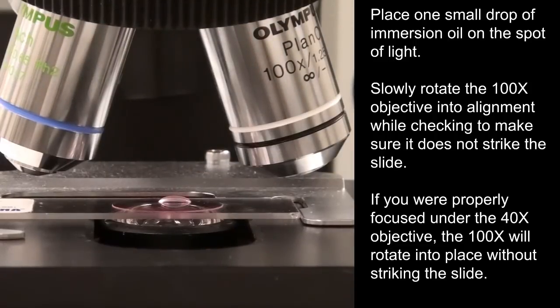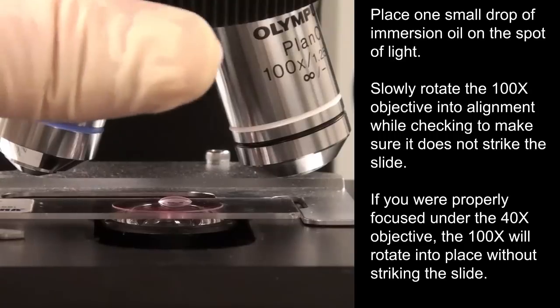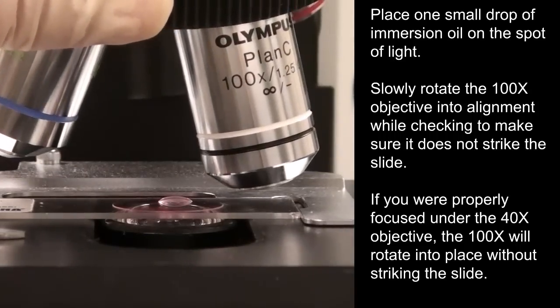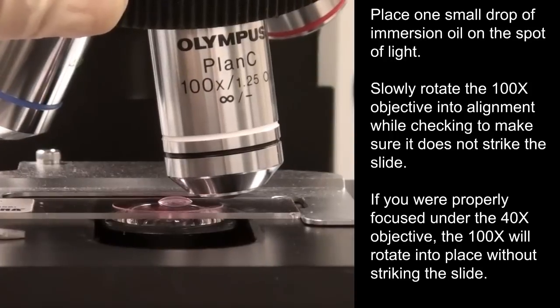Slowly rotate the 100x objective into alignment while checking to make sure it does not strike the slide. If you were properly focused under the 40x objective, the 100x will rotate into place without striking the slide.